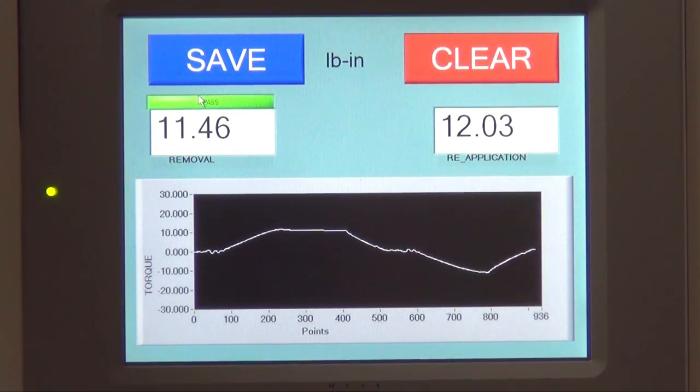To save the results, press the blue save tab. To clear the results, press the red clear tab.